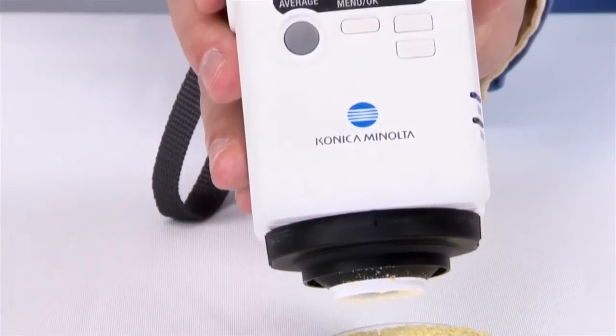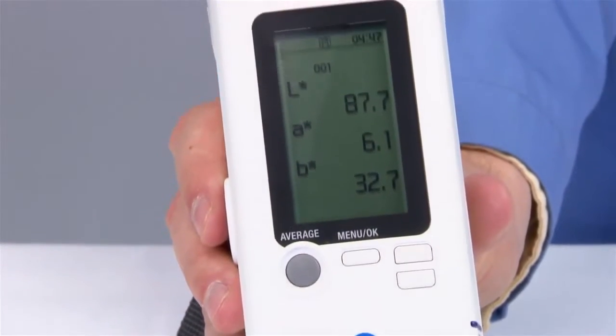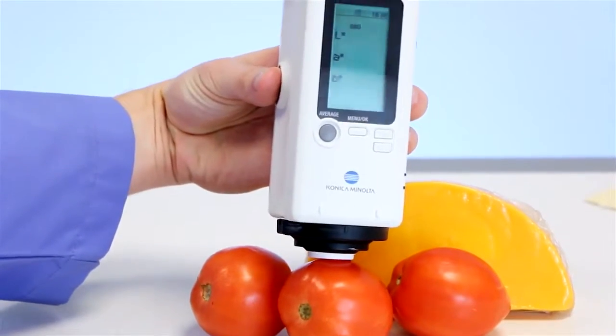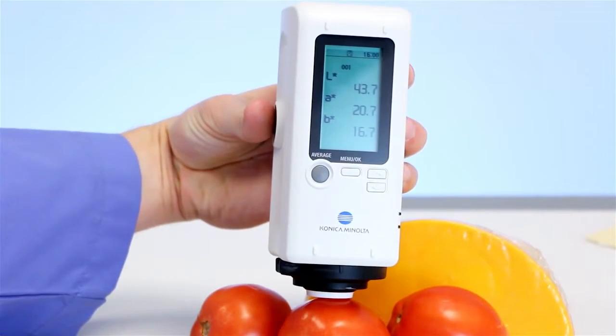With a protective glass cap, you can directly measure the color and whiteness of foods, raw materials, and wet samples in paste, solid, or powder form.